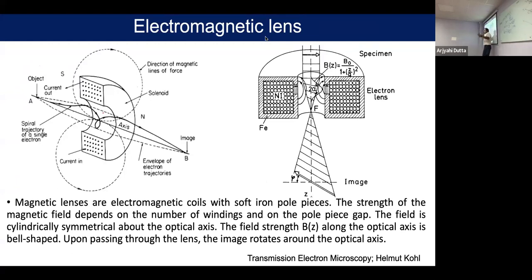So here we can use the electromagnetic lens system to converge and diverge the electron beam. That is not possible for the X-ray, because for X-ray we don't know how to converge or diverge. Here we have a charged particle. We can use a highly negatively charged particle to converge, or the magnetic field to converge them. That is helping us to get an image.